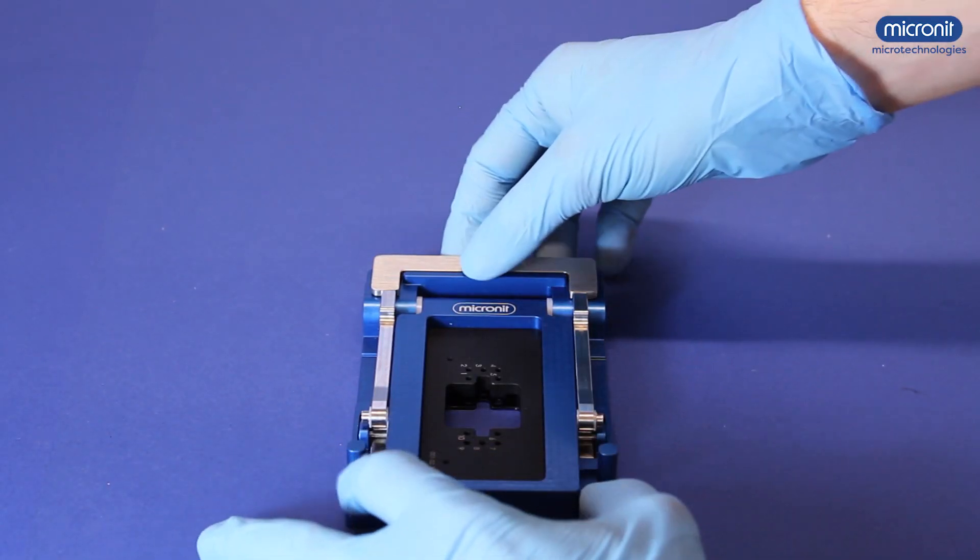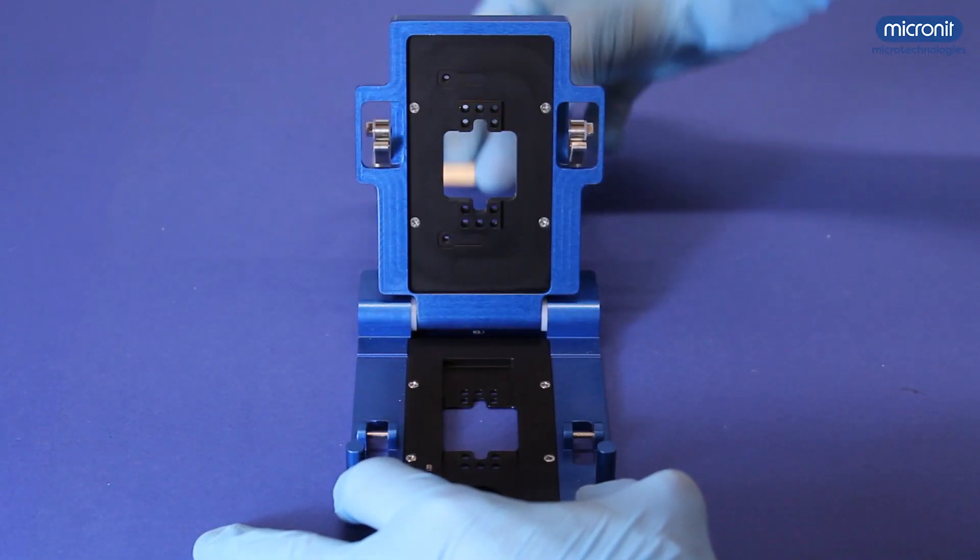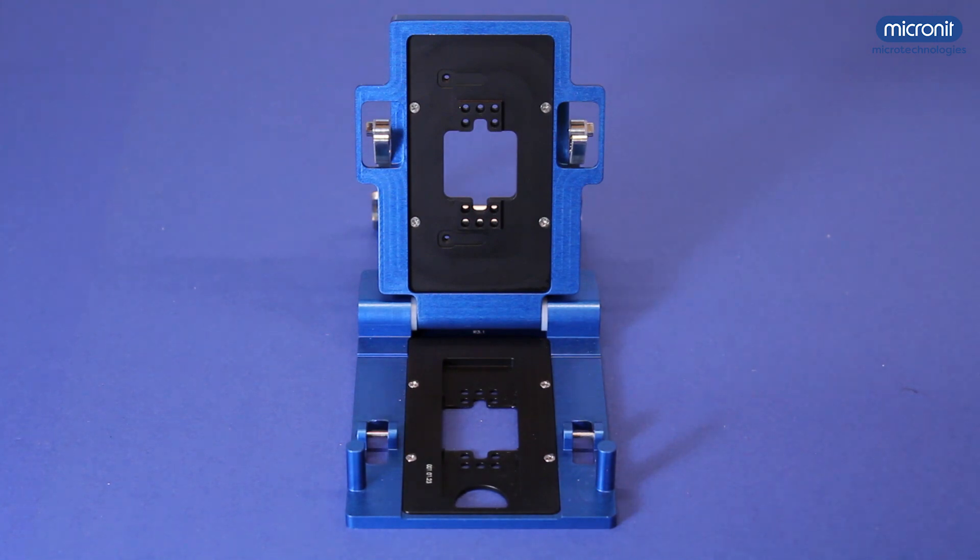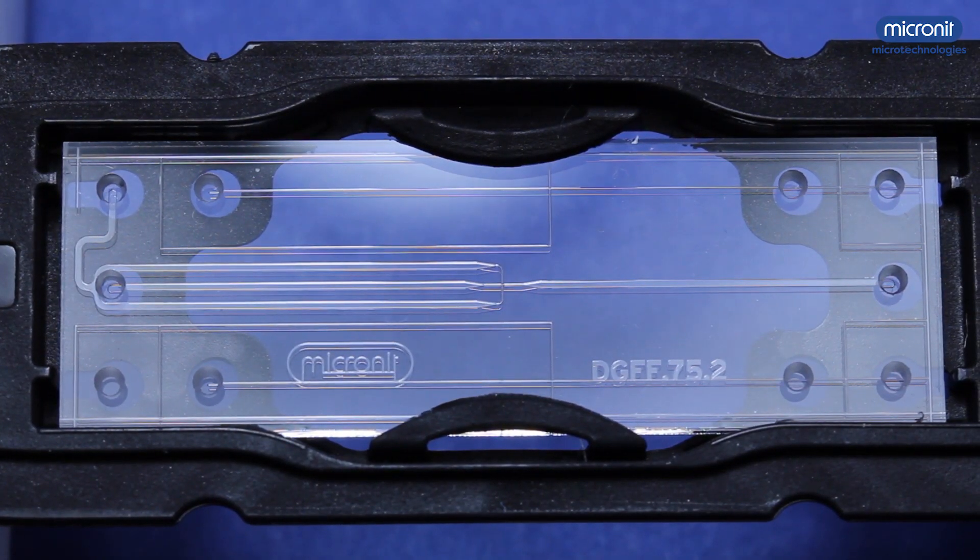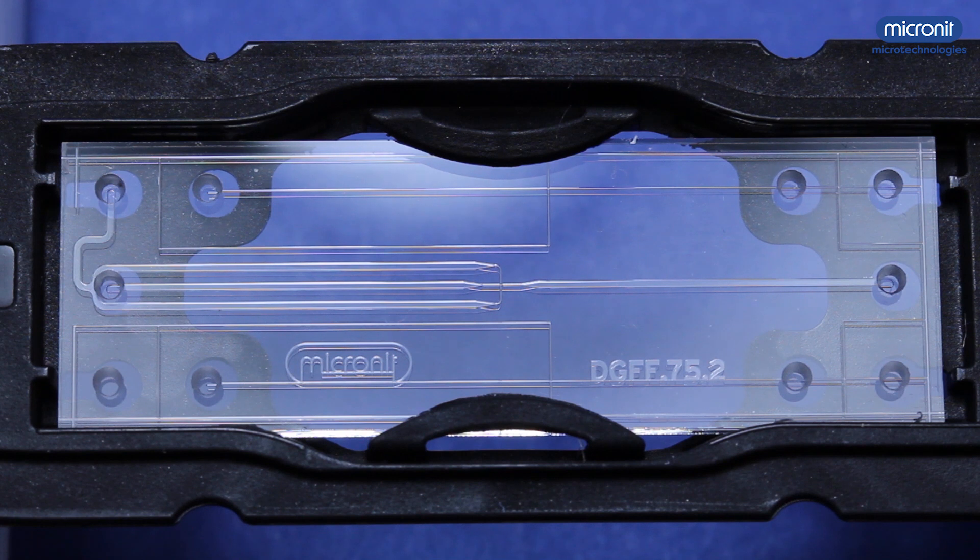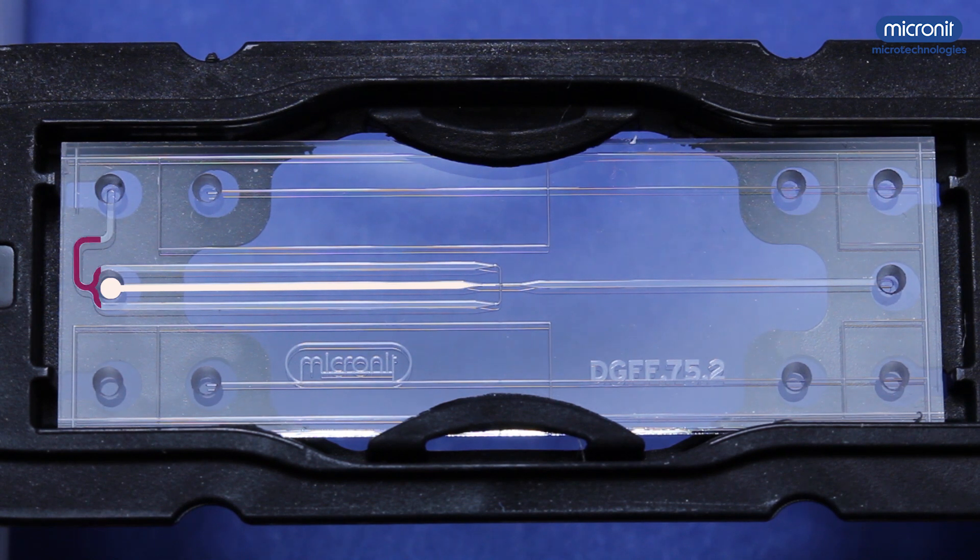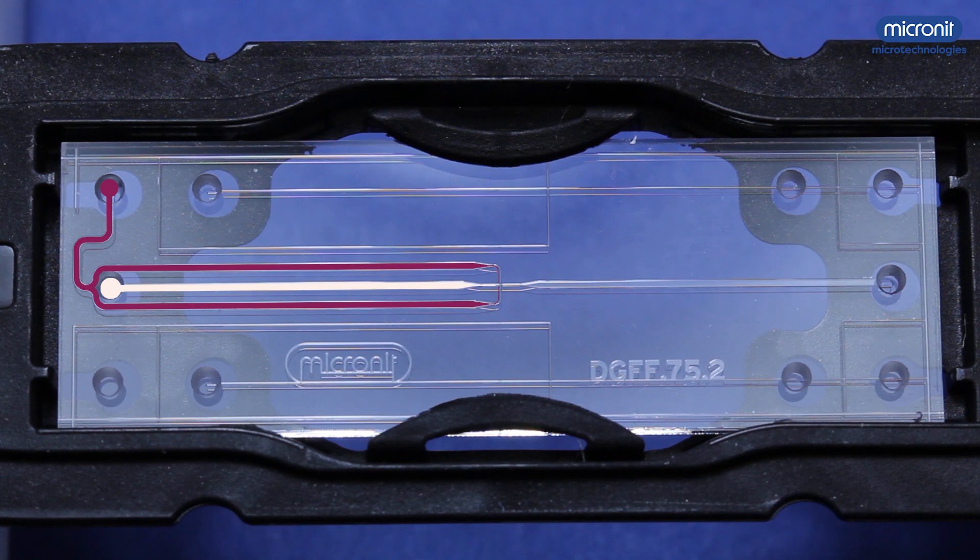Up next is the chip holder. Let's open it. Take your droplet generator chip and investigate which holes should be connected. In this case we have one inlet for the dispersed phase, going through the middle. The inlet above is for the continuous phase, going around it. And the formed droplets continue to this outlet.